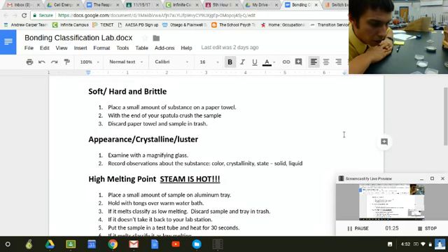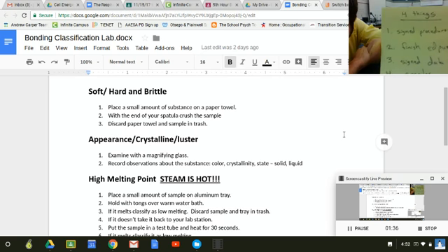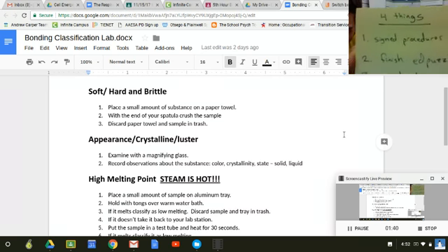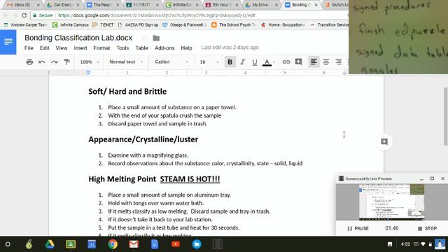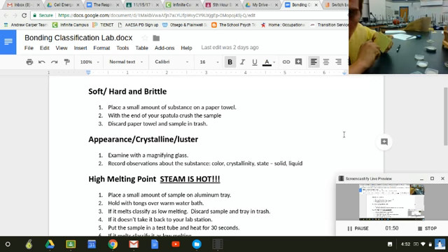Today, we have 5 unknowns that we're trying to classify. A, B, C, D, and E. At this point, if you're watching the Ed Puzzle video, you've probably completed number 1 already, but you're still going to have to finish number 2, which is this Ed puzzle. You're going to have to do number 3, which is get your data table set up. And then you're going to have to do number 4 before you start, which is goggles.